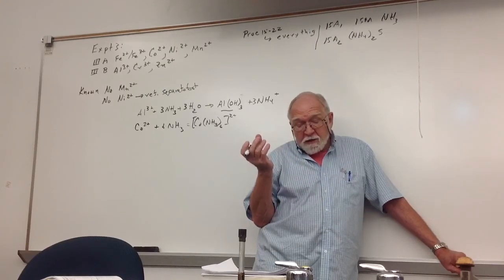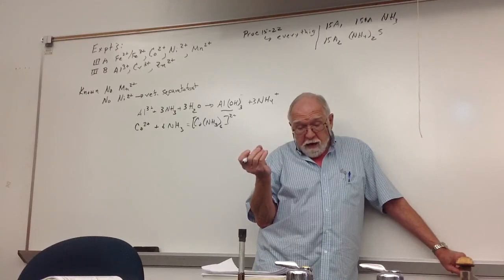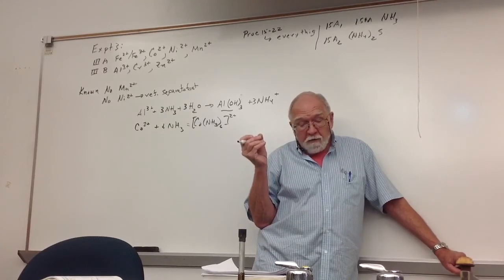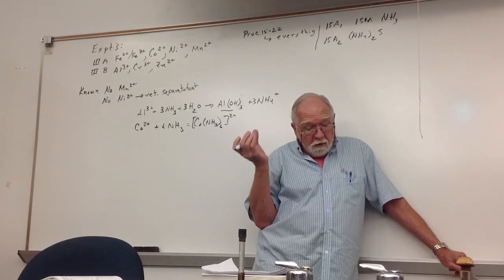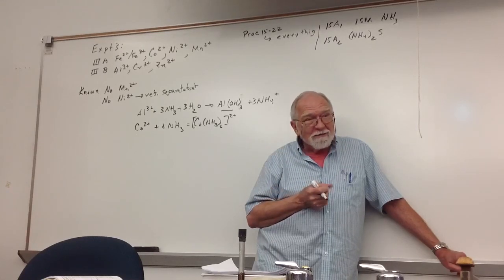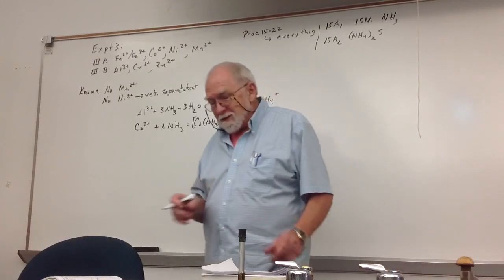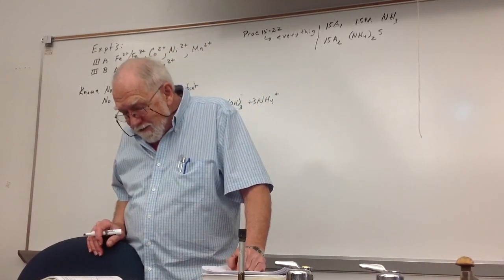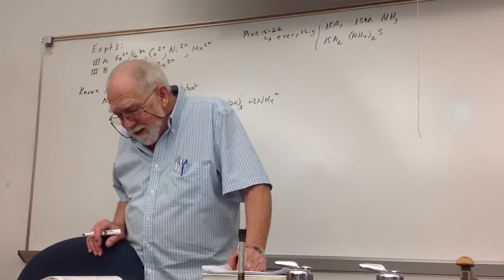The 2 things you can do to make them coagulate is heat the test tube and also add some ammonium acetate. Now, one of the things he points out is that when you try to heat the test tube with the ammonium sulfide, sometimes it bubbles out of the test tube and you have a beaker full of black particles again because of the precipitate bubbling out. So all you have to do is be careful there. If it starts foaming up to the top, you lift it out of the boiling water bath, right?